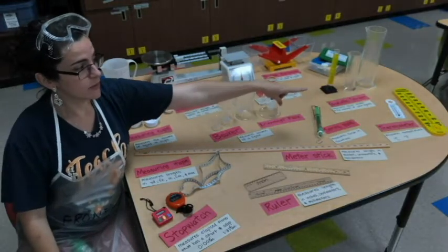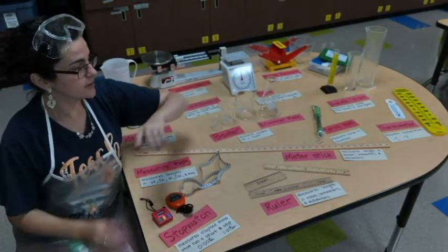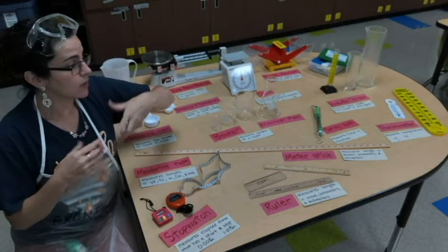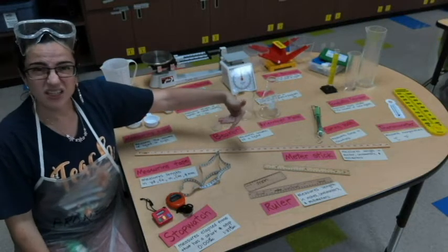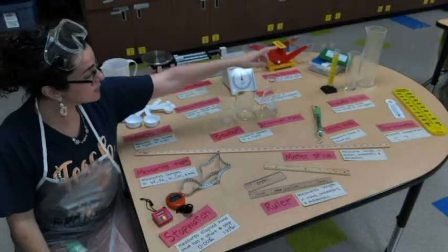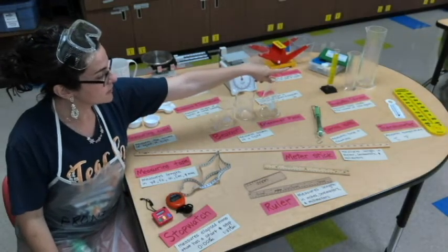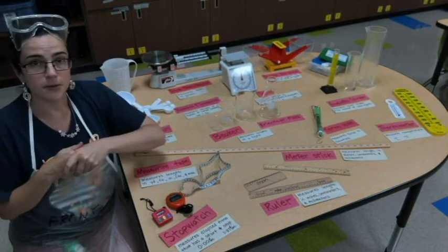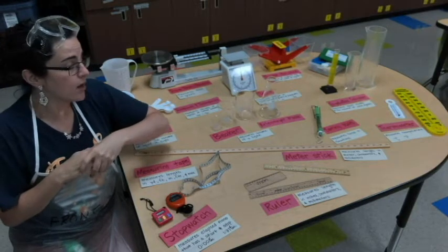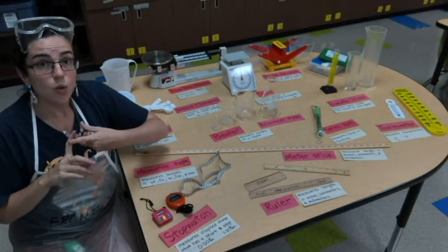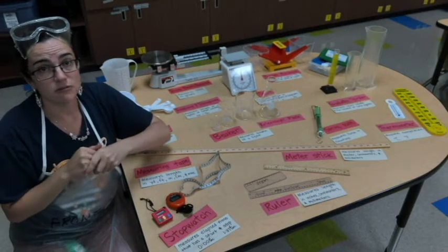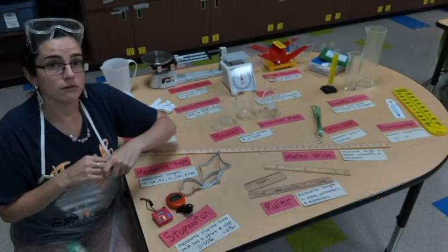We have thermometers on the other side of the table. Those help us measure temperature in either Celsius or Fahrenheit, or graduated cylinders. They can help us measure volume in either liquids or by placing something in there and doing some calculations to measure the volume of solids.